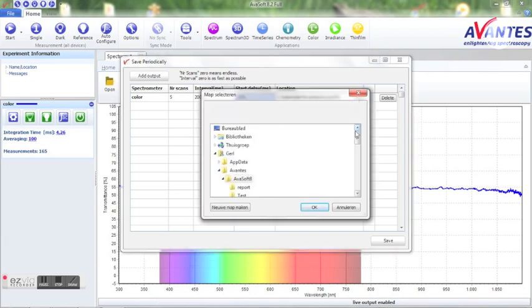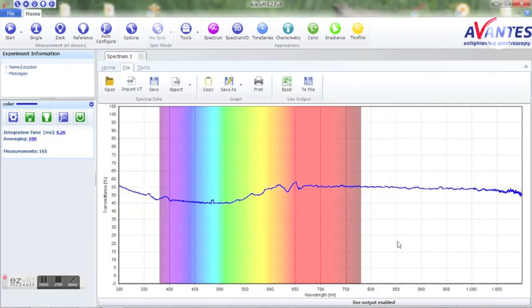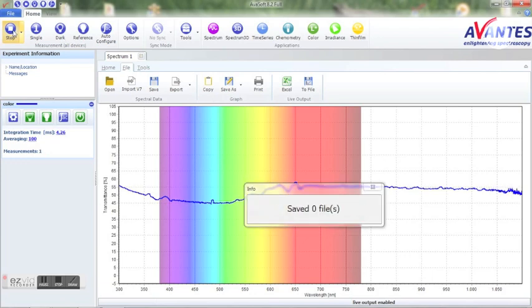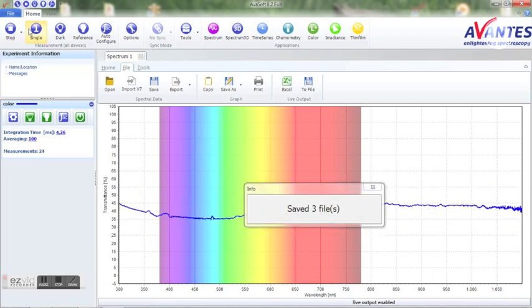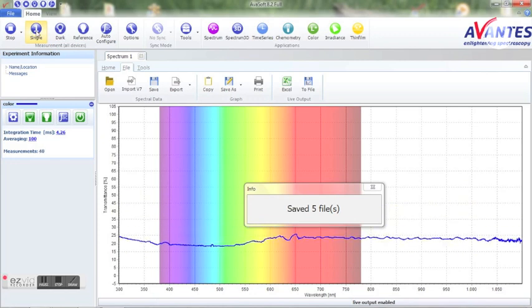I recommend creating a new subfolder in the save location for easy retrieval of the data afterwards. Press save and start the measurements in the desired mode. A popup window will occur stating how many measurements have been taken.